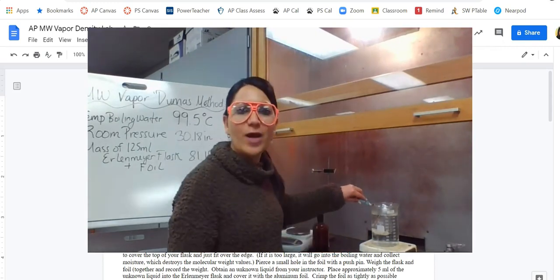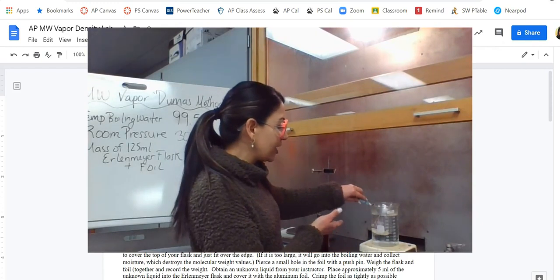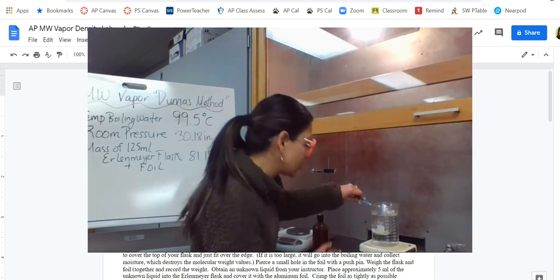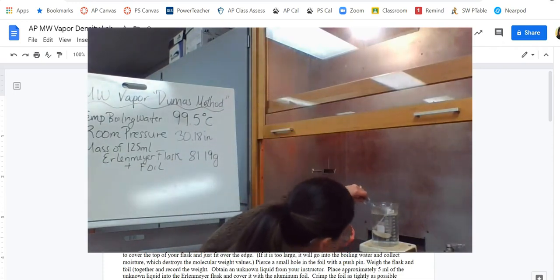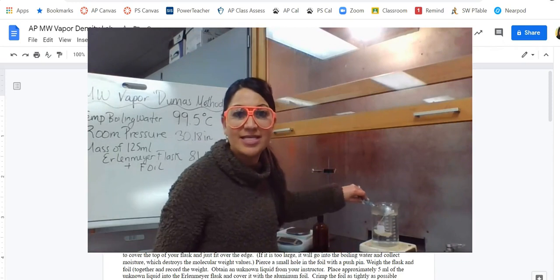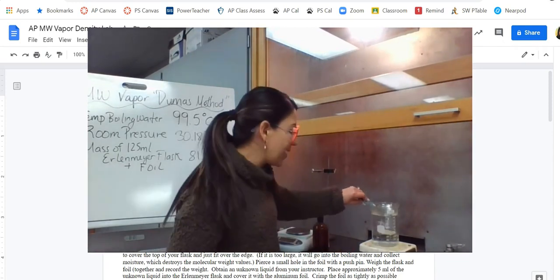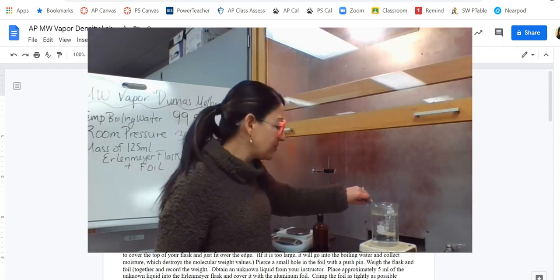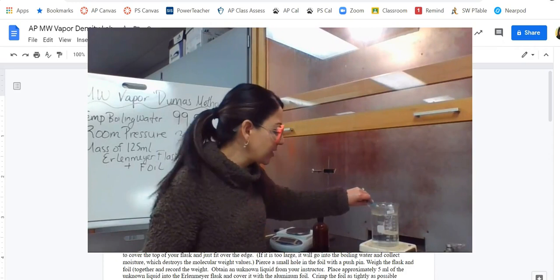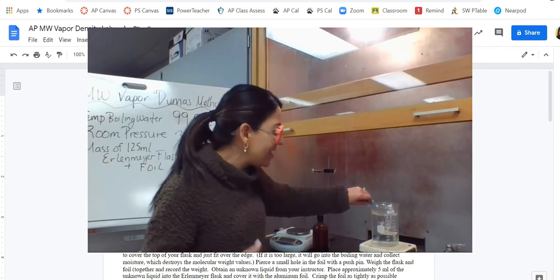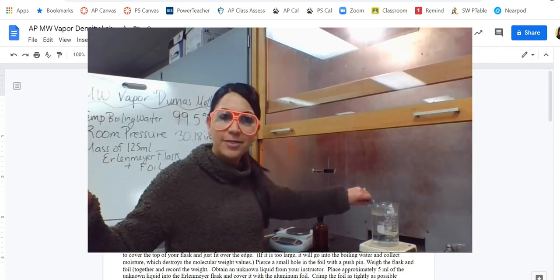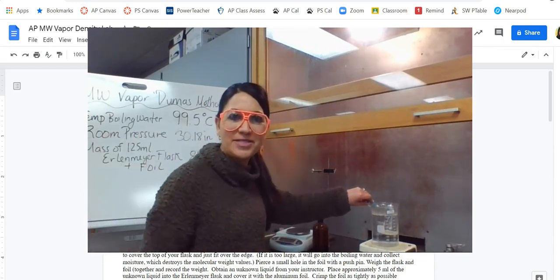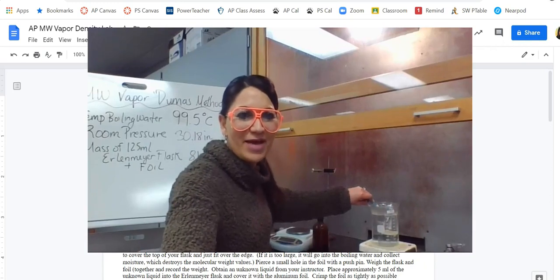So there are a couple of things with that that we're going to come back to. So let's let this go right now, and what should happen after is I'm going to pull it out and I can't actually even take it out even to look at it. So I have to kind of look at it down here to get an idea of whether or not the liquid is vaporized. And so I'm going to kind of shift it back and forth just to see, but it is volatile so it shouldn't take too long. It's got a lower boiling point. Most of the alcohols do have a lower boiling point. And so I'm going to do that and then I'll run it under cold water. And once I run it under cold water, then we can come back and we can weigh it and we've got two more pieces of data that we need. All right, so I will be right back with you.